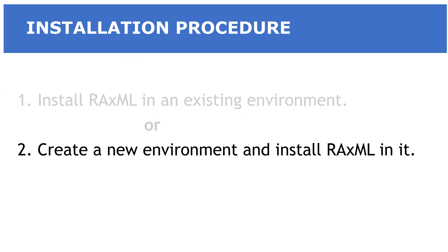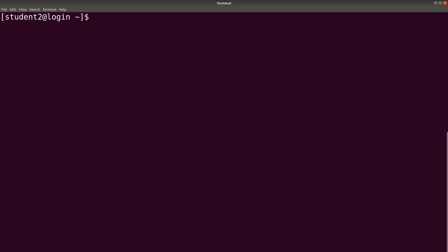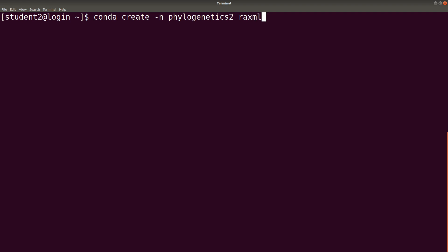So, the second approach where we are going to create the environment and install RAxML at the same time. This is how we do it. We say conda create -n. Then we indicate the environment's name. Let's use phylogenetics2 to differentiate the previous environment. Once we have this, we specify the software we want to install. In this case, RAxML. Of course, you can add a channel flag here. So, let's just do that. We say -c bioconda. We have it there. So, we can now execute it.